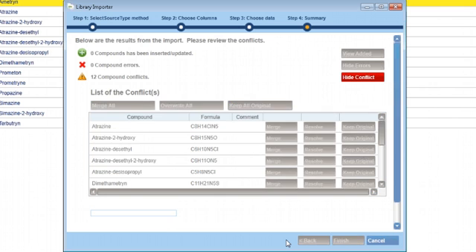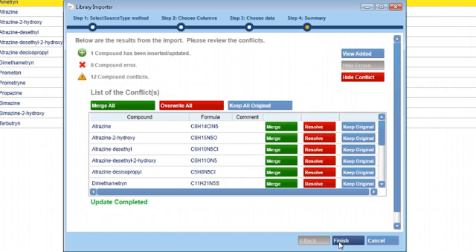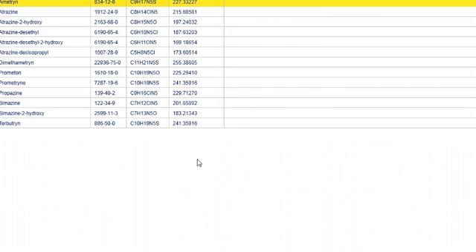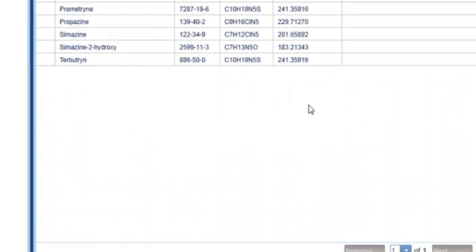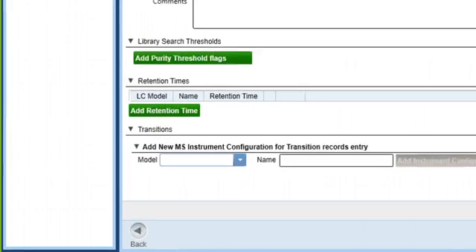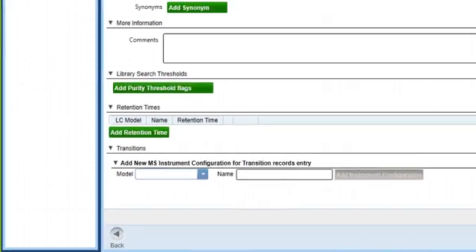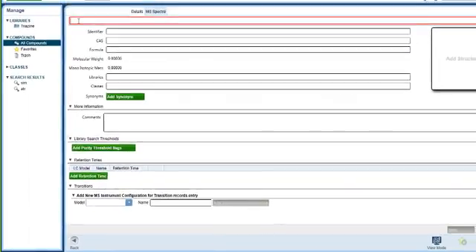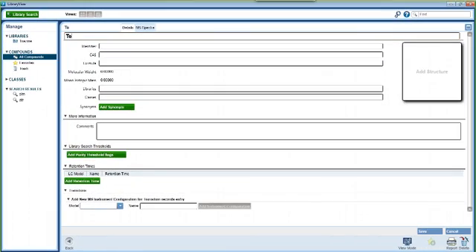Once you have resolved all the conflicts, you can finish the compound import. Now let's take a look at how to add a new compound to your library database. Start by clicking the add compound icon in the lower left hand side of the view compound window.